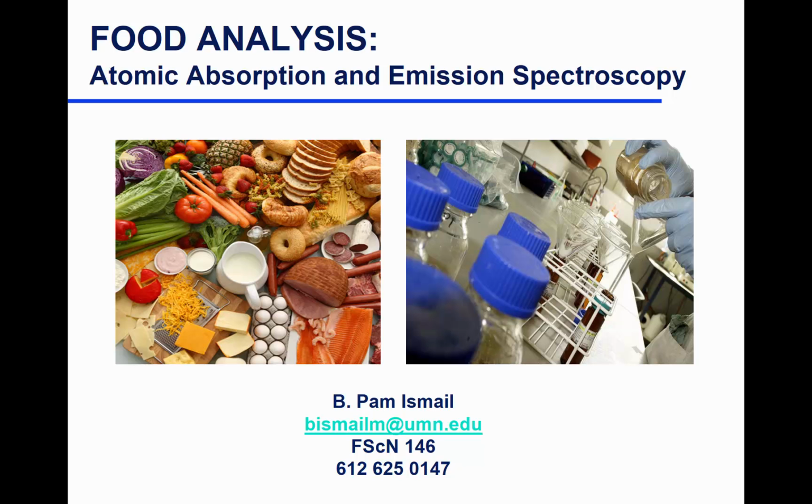So today we'll talk about atomic absorption. More than half of you already took the lab, so this is going to be a nice, easy theory review for you. Others, this would be an introduction to the lab on Wednesday.